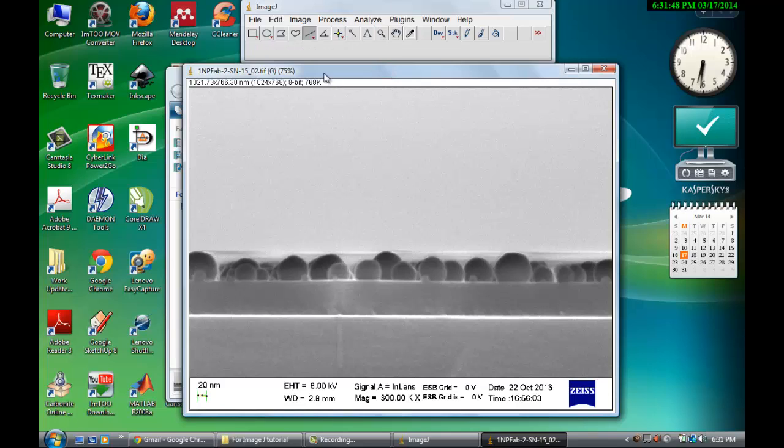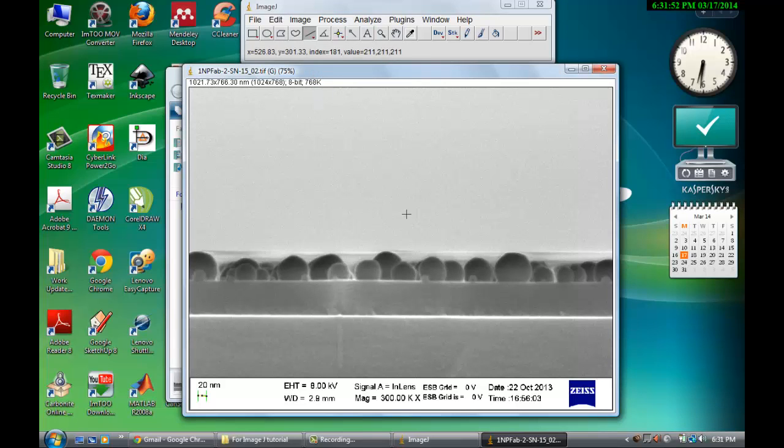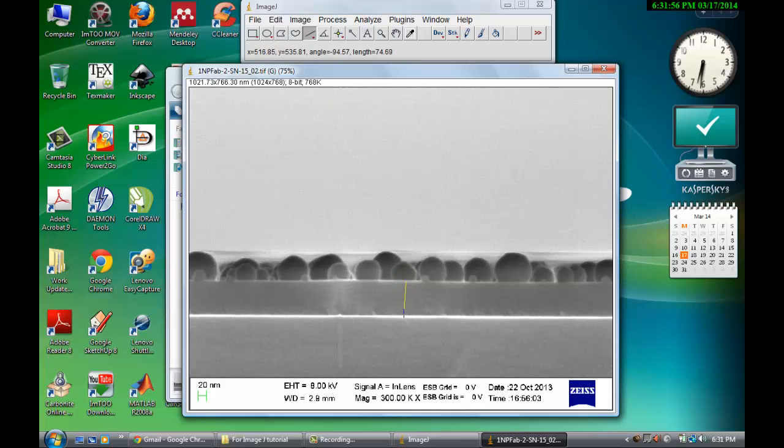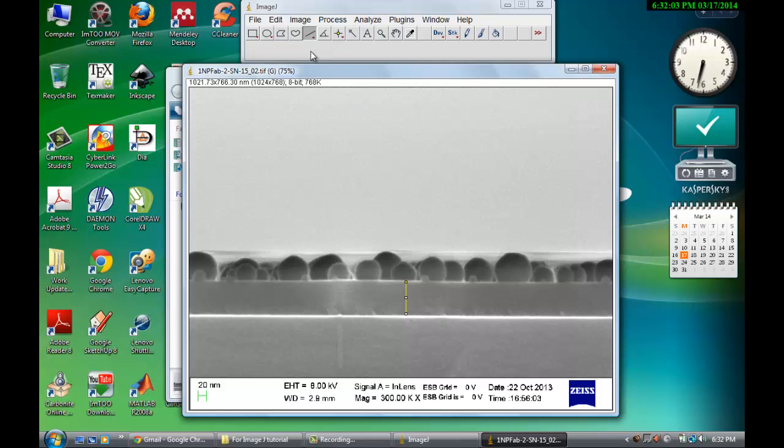Now if you want to see what is the thickness of this, then again what you have to do is just drag it. You see the distance here.